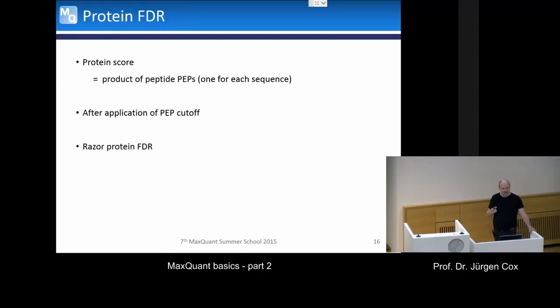One just doesn't know. The evidence is only there that at least one of these protein groups where it occurs is actually identified. That's why, under normal circumstances, unless one has a good reason not to, one should use each peptide only once. Otherwise, you would, for example, identify like 200 olfactory receptors just because they have one peptide in common, which one should probably not do.